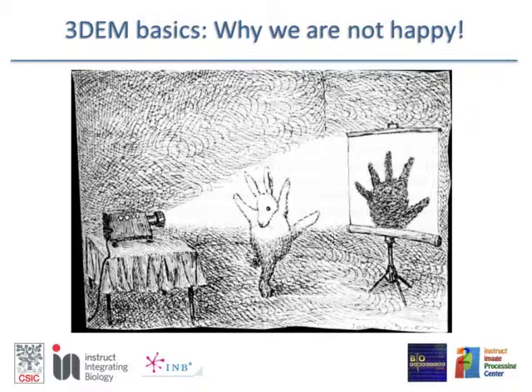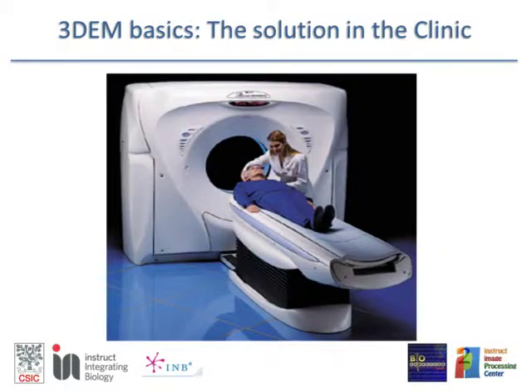But you can go through the mathematics of that, mathematics from the beginning of the 20th century, so about one century old, nothing new, but they explain that we need to get this 3D structure by combining many 2D images. And this has been done. This is done every day in the clinic.